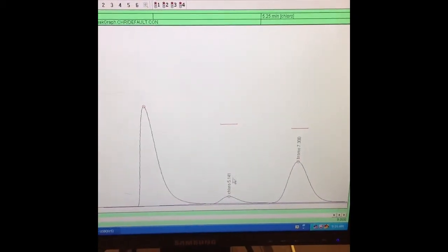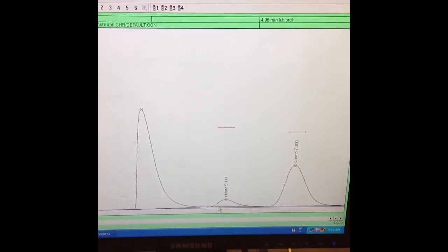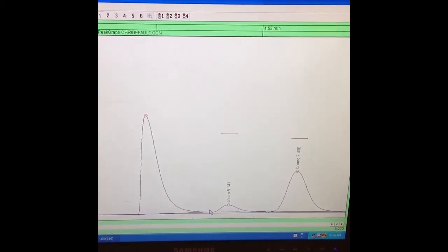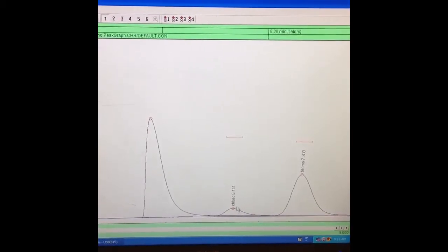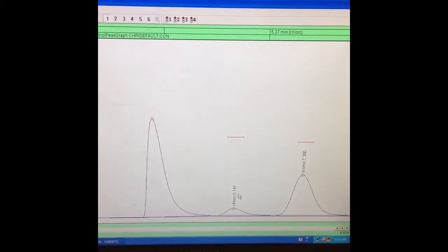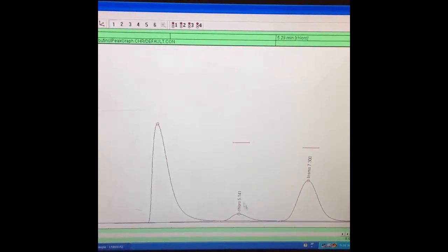So this is our retention time, just specifically looking at the chloro peak right now. And basically, it's as much time as it lasts through the column. And since we set a standard, we're able to compare, and if that standard has the same retention time, we can actually know that this is our chloro peak.